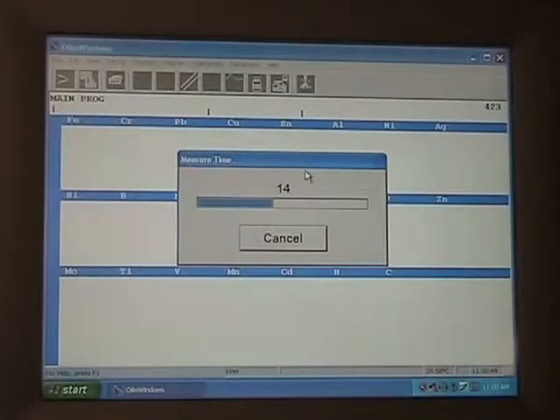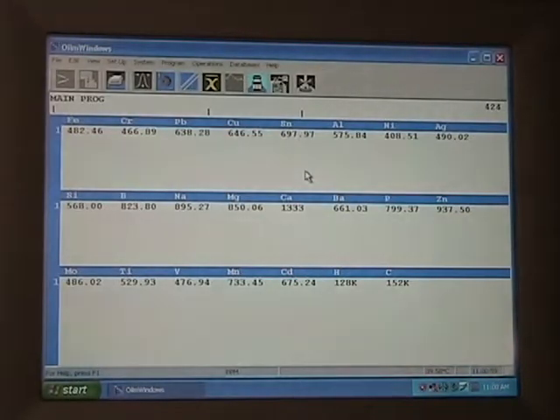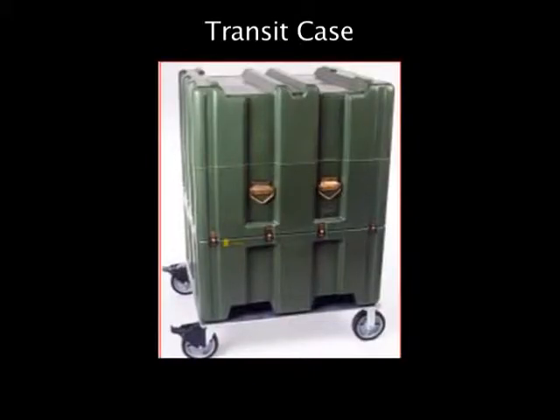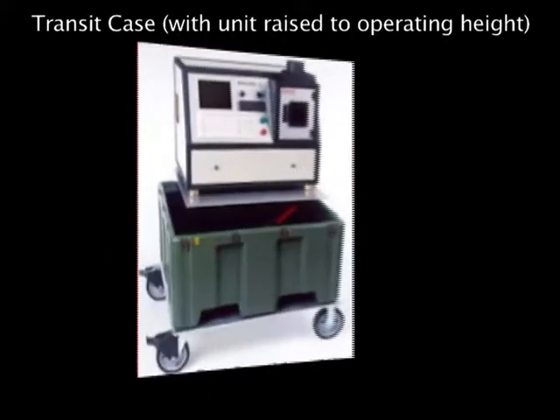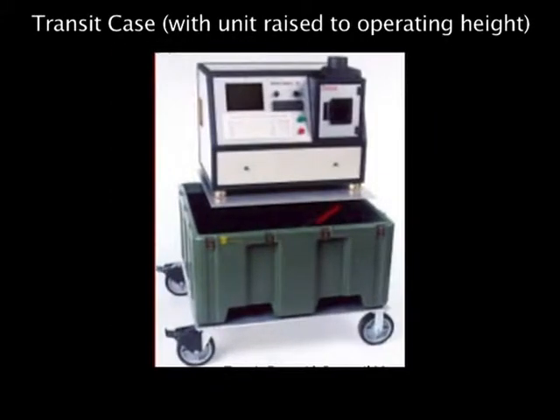The analysis process to obtain the concentration of up to 32 elements simultaneously takes less than 1 minute. The Spectroil is very simple to operate, does not require any special training or an operator with a technical background. Furthermore, it does not require the use of any special utility gases and is always ready to analyze samples. Spectroil is designed to operate in harsh environments and performs equally well in a laboratory or on-site where immediate oil analysis results can be vital and sample turnaround time is crucial.